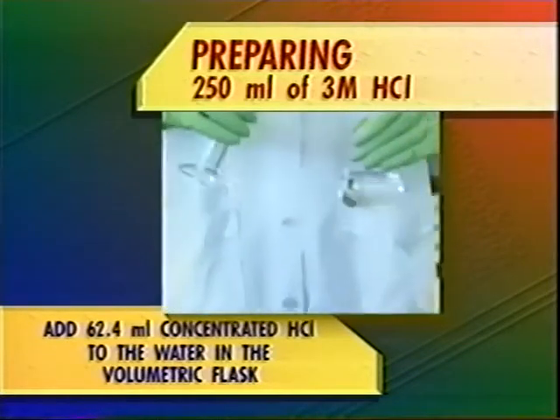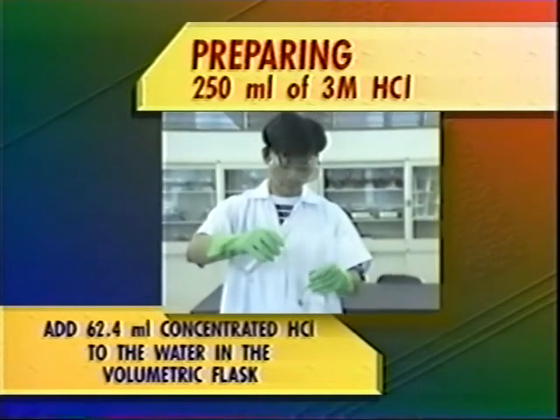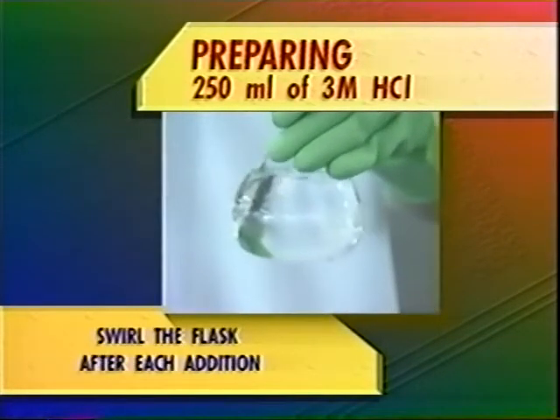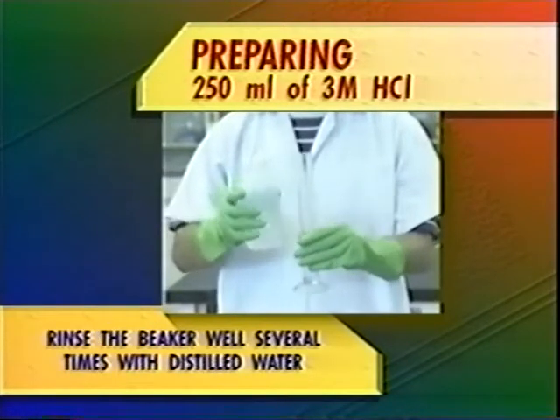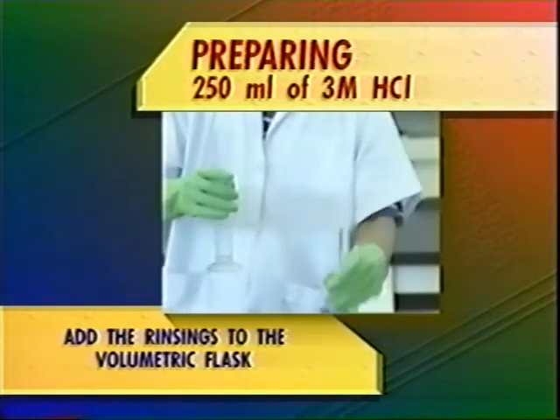Add the 62.4 milliliters of concentrated acid to the water in the volumetric flask in small portions at a time. Swirl the flask after each addition. Rinse the beaker well with distilled water several times and add the rinsings to the volumetric flask.